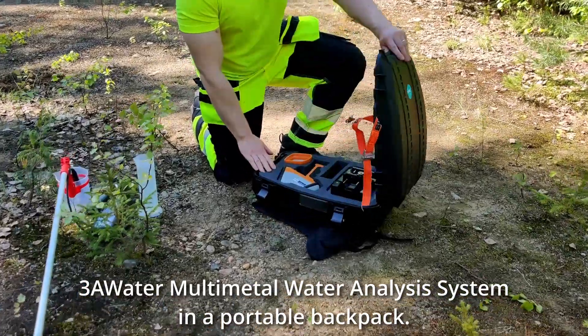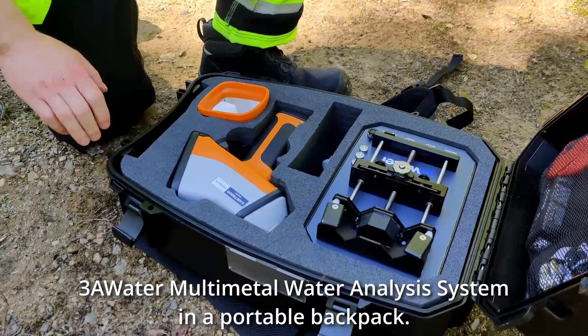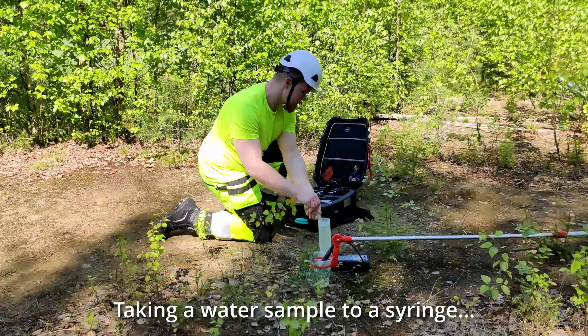3A Water Multimetal Water Analysis System in a portable backpack. Taking a water sample into a syringe.